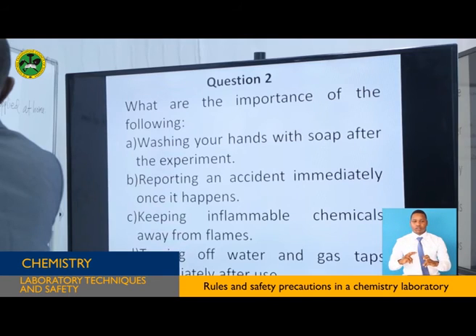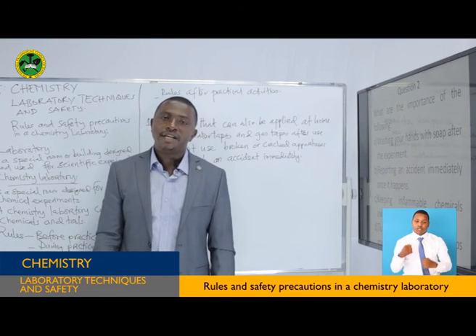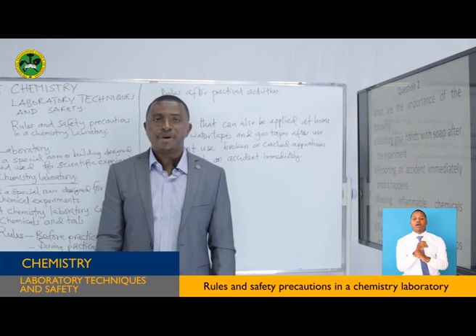Reporting an accident immediately once it happens. What is the importance of reporting? It's that when you report an accident immediately, you can get immediate help from your teacher or laboratory assistant.